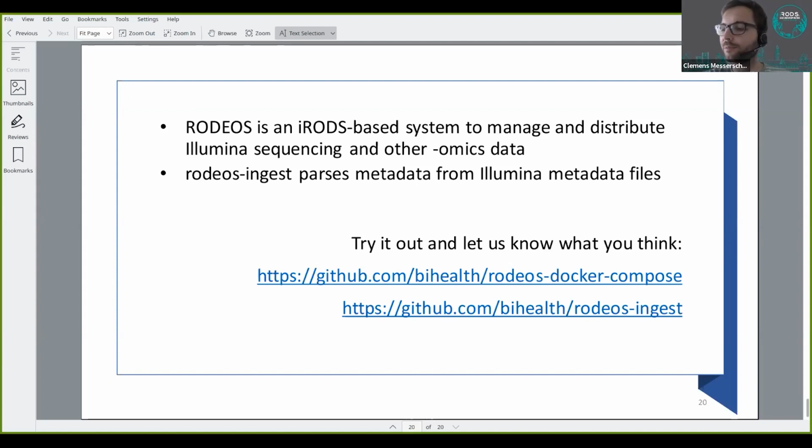So with this Samba, we are only really using it to expose the CephFS as a network share to the Windows-based Illumina machines. So you'll have some files copied over about some experiment, and the information that can be known automatically is automatically associated with the data. But how's the information about what this experiment is called, why somebody's doing it, how does that get categorized and stored? So, right, okay.